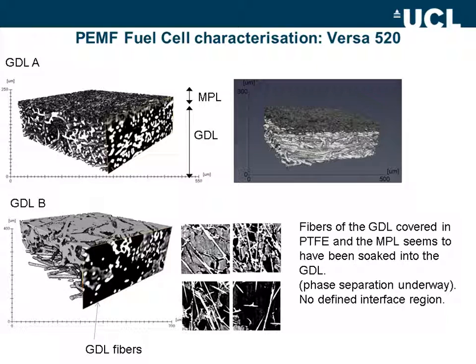We look, in addition, at polymer electrolyte fuel cells. Here you can see some gas diffusion layers and microporous layers that have been imaged in situ. Again, one of the beauties of the non-destructive X-ray computed tomography techniques that Arno introduced is the ability to study materials under simulated operating environments. And we look at GDLs, for example, gas diffusion layers for fuel cells under compression and at different temperatures.